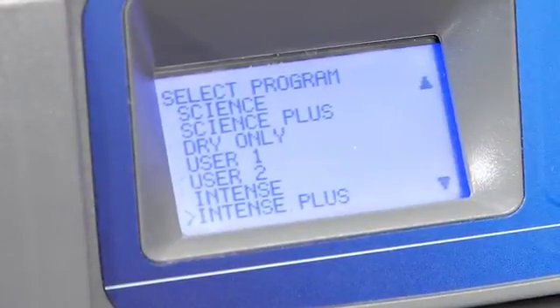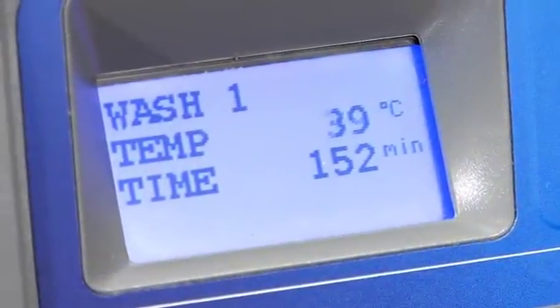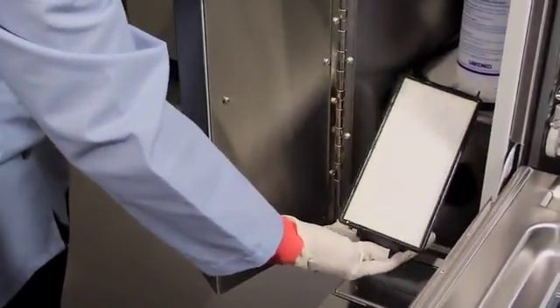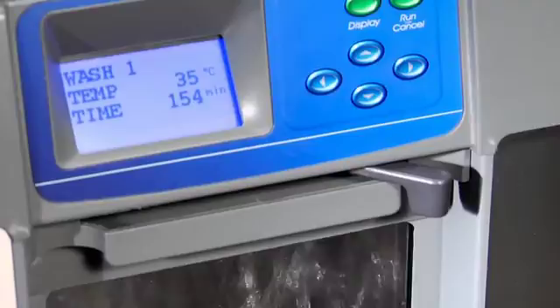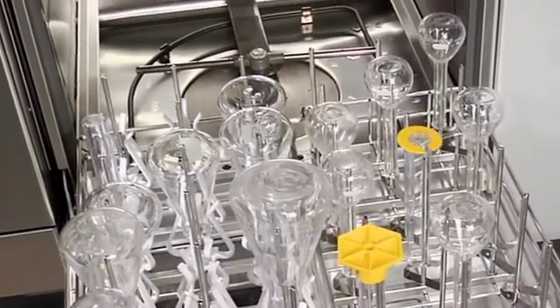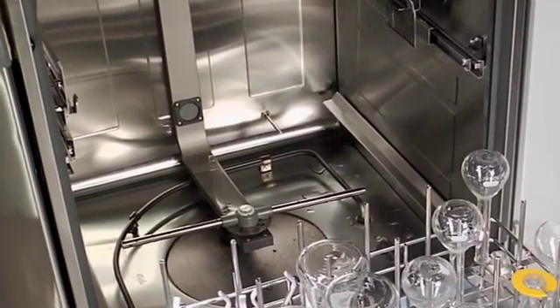Flexible cycle programs let you choose from up to 10 factory preset and two custom design programs. A dry cycle from zero to 250 minutes is standard on all washers, and a HEPA filter on the Vantage removes airborne particulates. A dry only cycle is also available. Up to six rinses, either tap or pure water, per program are supported. A purified water pump is standard and allows the use of non-pressurized pure water. A steam generator produces hot water vapor to penetrate dried residue so detergent and hot water can clean effectively.